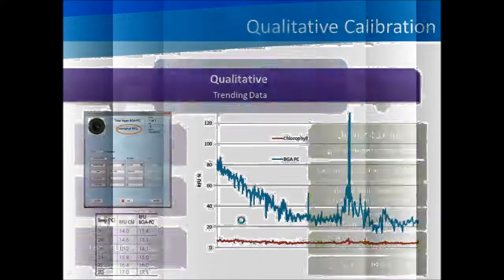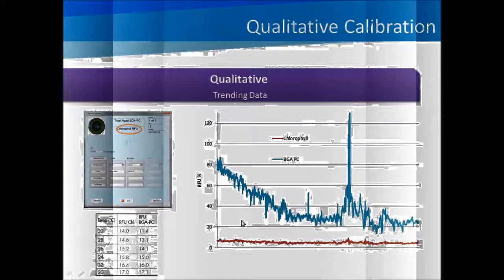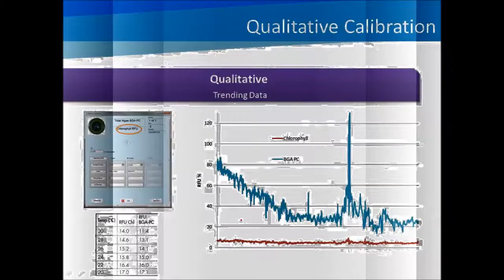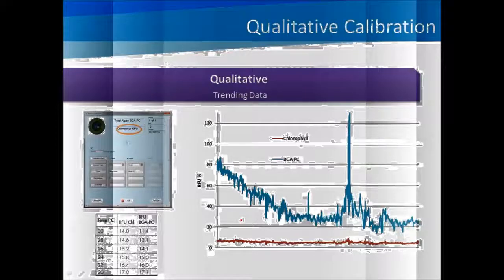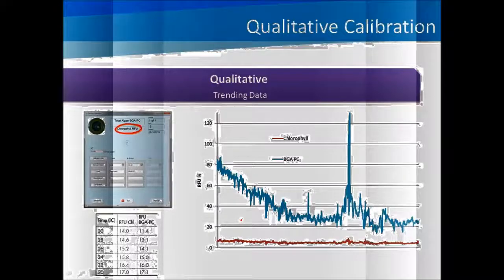approach. Now, the first out-of-box calibration should be a 2-point cal as you take the sensor for the first time. What this does is it sets the slope of the sensor. And when you're doing the 2-point cal, the first cal point is filtered DI water, and that's representing zero fluorescence. And in the software, we select the RFU unit Brandon described, which is a percentage output from 0 to 100. And we accept the cal once the sensor shows that it's stable.